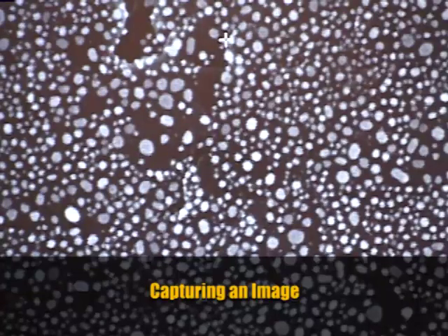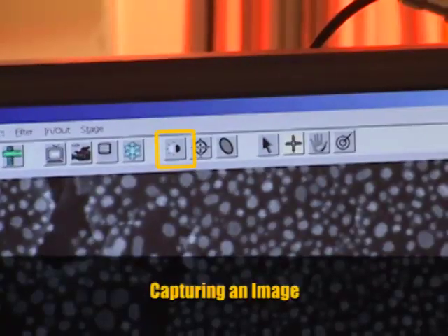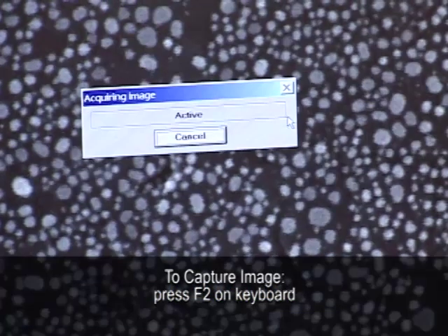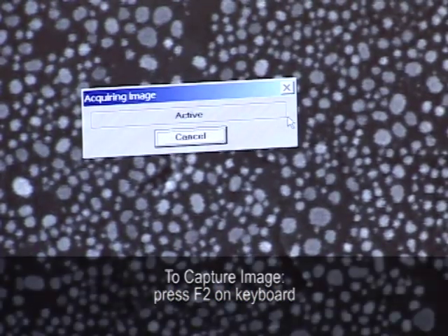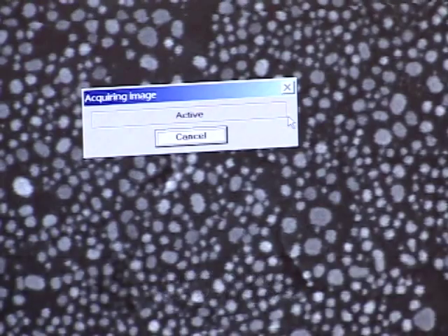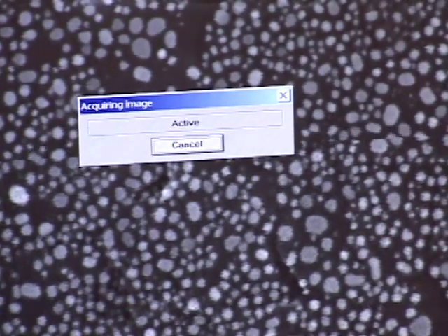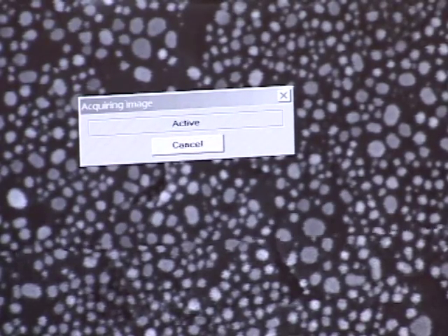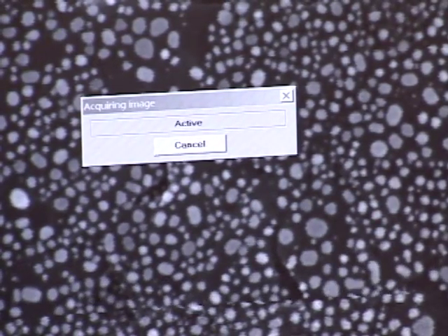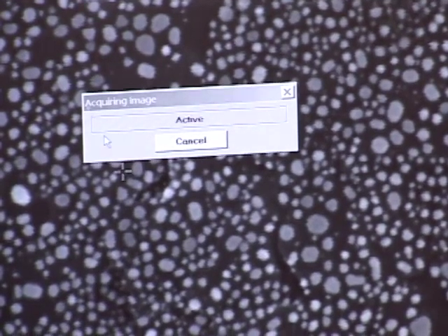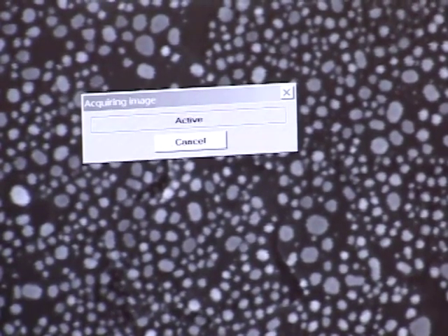To capture an image, the first thing I usually do is auto adjust the contrast, and then I push F2 on the keyboard to capture the image. F2 is a macro that scans the whole field of view at the slowest scan rate — it's going through slow scan 4 right now. At the end of the field it's going to freeze this image and block the beam so the sample isn't being exposed to the beam right now, and we can take our time looking at this image.